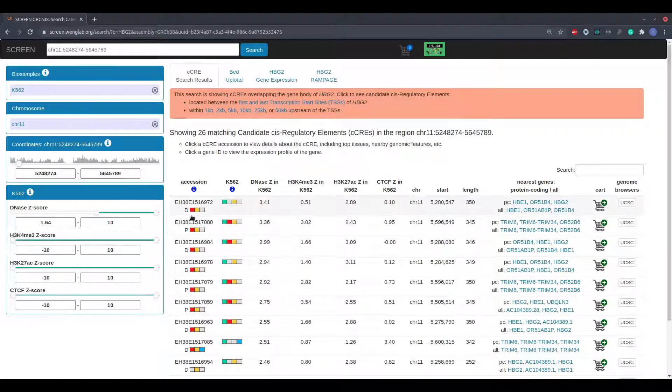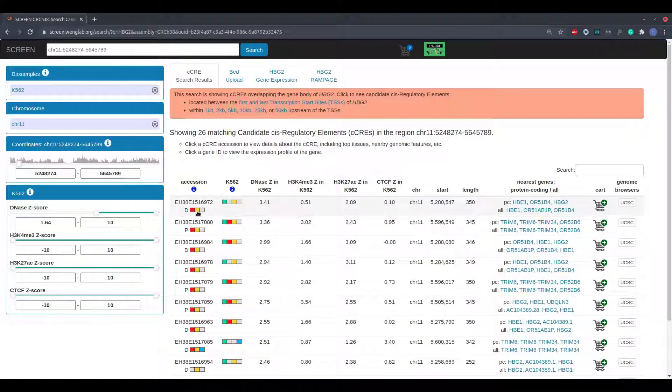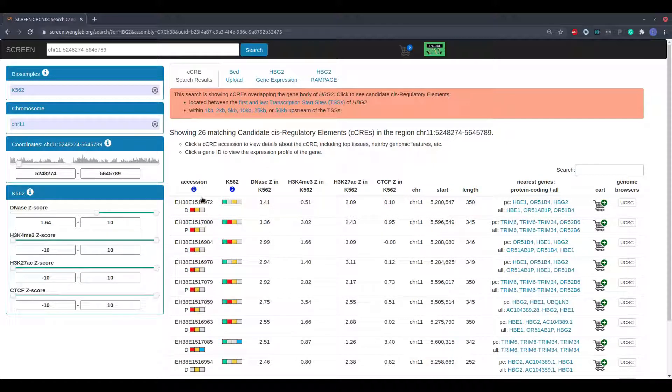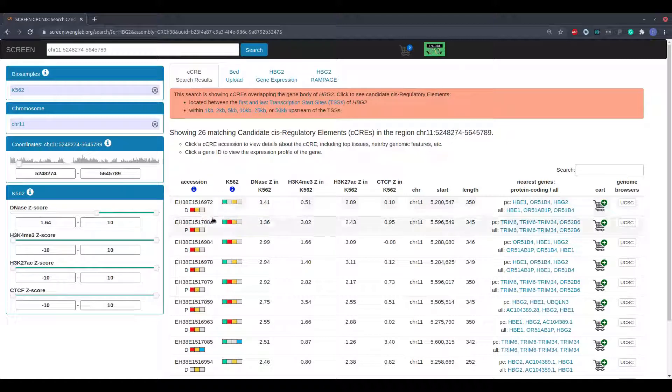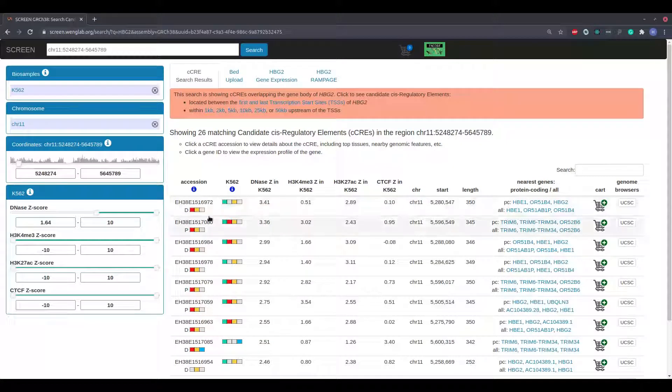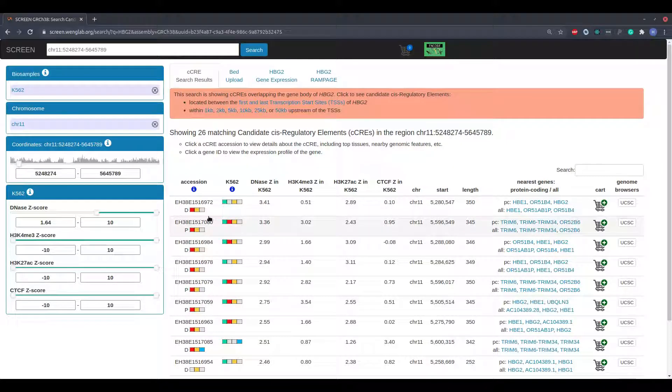The colored boxes provide a summary of which epigenomic Z-scores are above 1.64 for the candidate regulatory element, both within the selected cell type and across all cell types. A colored box indicates that a given mark has a Z-score of at least 1.64, and a gray box indicates that the mark has a Z-score of less than 1.64.